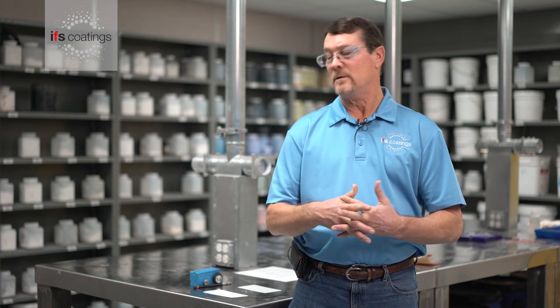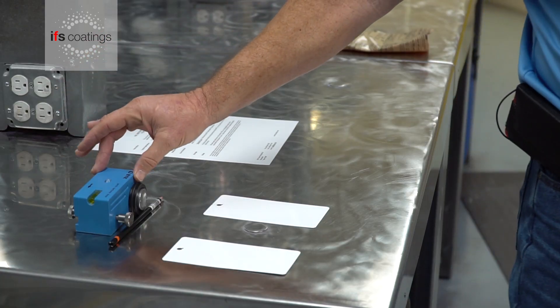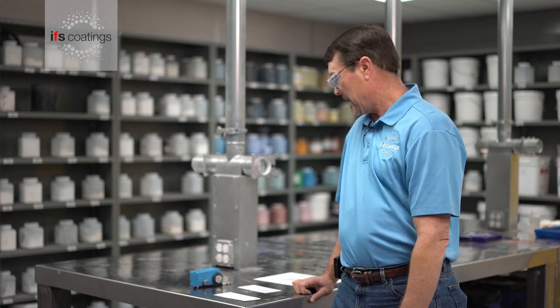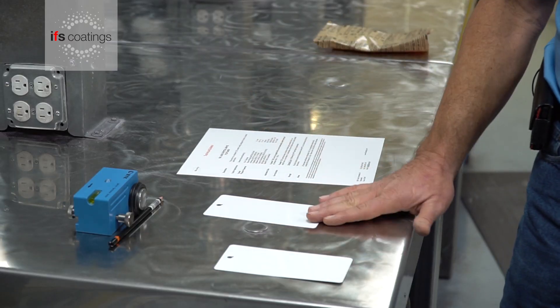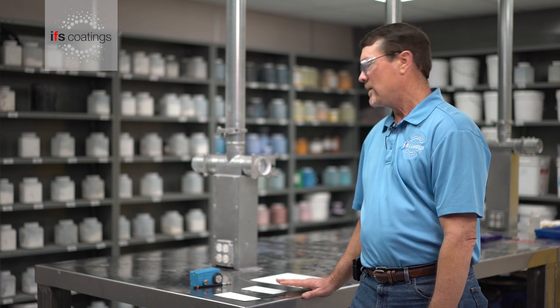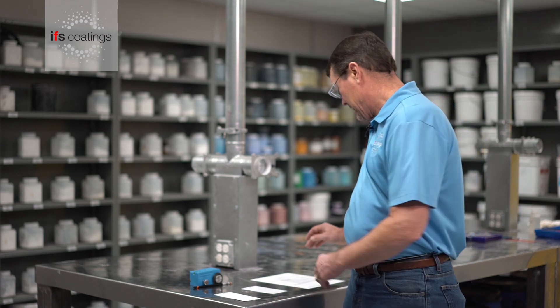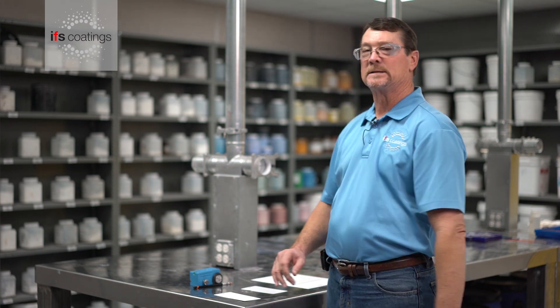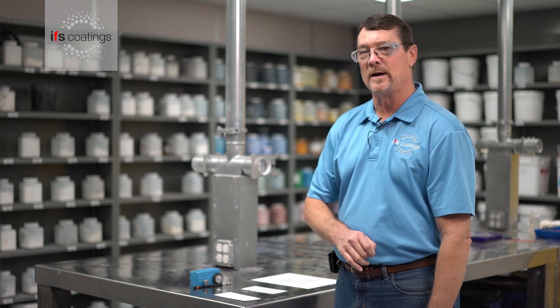There are some devices that have a fixed angle, like this particular unit we have right here, or in some cases the test can be done by hand. The particular product we're testing today is our REL 9003 Crystal White, and according to its technical data sheet, it has a hardness range of H to 2H.